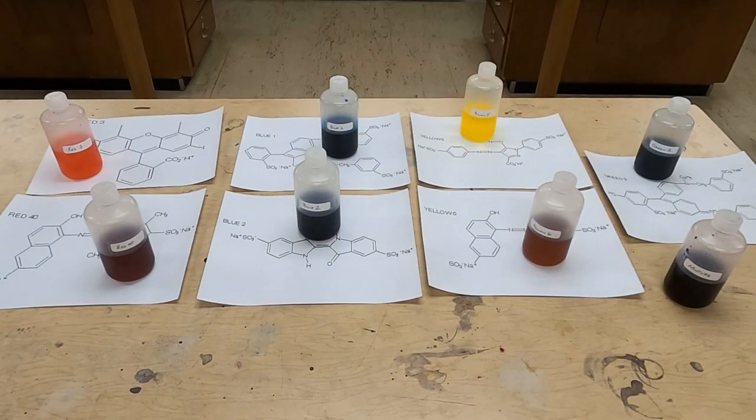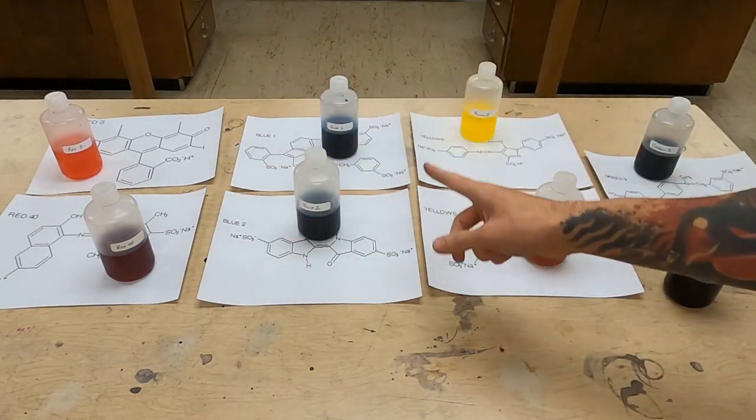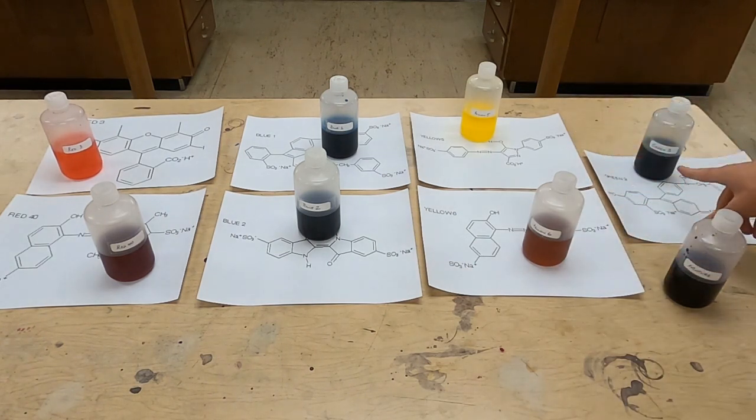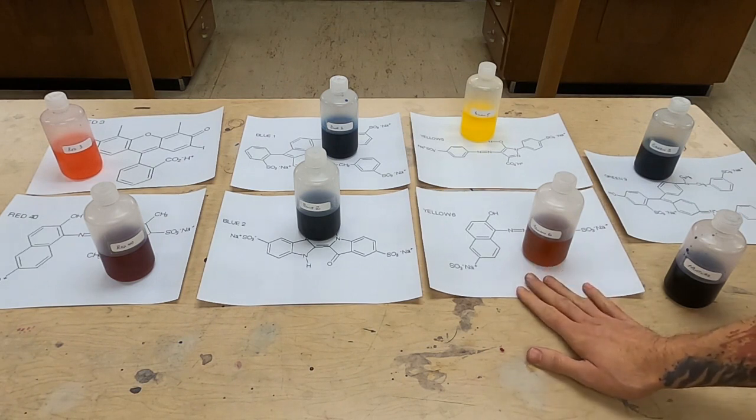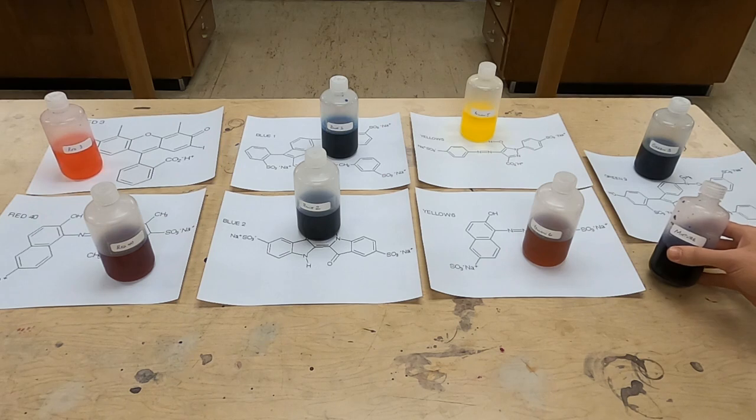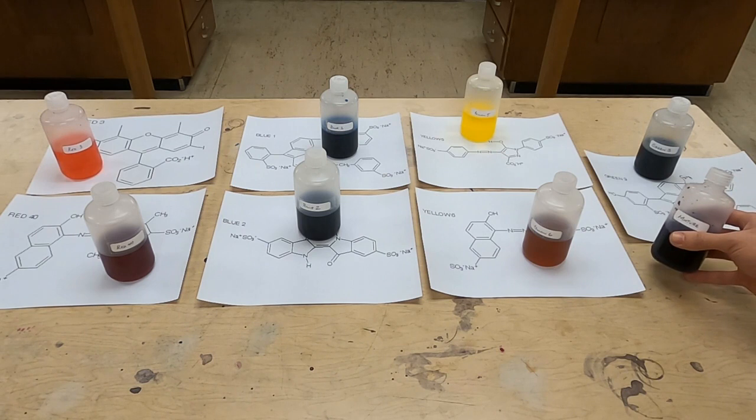So here I've got all seven of the pure samples mixed up, as well as the mixture here. There are two reds, red 3 and red 40. There are two blues called blue 1 and blue 2. There are two yellows called yellow 5 and yellow 6. And there's a green called green 3. They're all sitting on top of diagrams that show their molecular structure. The mixture we'll find out in a little bit as we test the pure samples and compare it to the mixture in spectrophotometry, or what colors of light each of these will allow to pass through a solution of it, or which colors of light get absorbed.